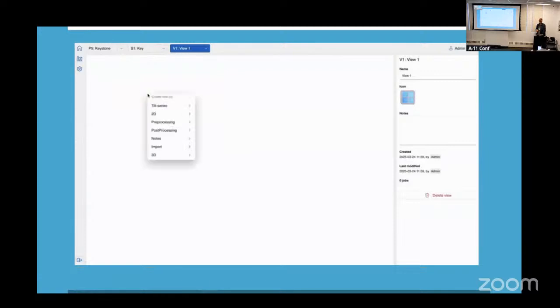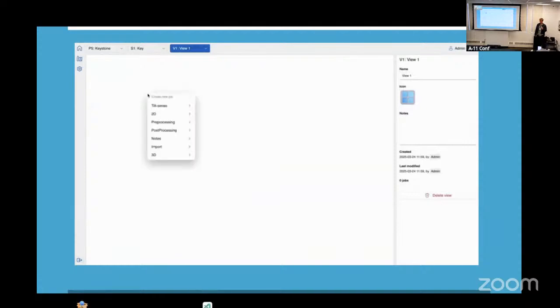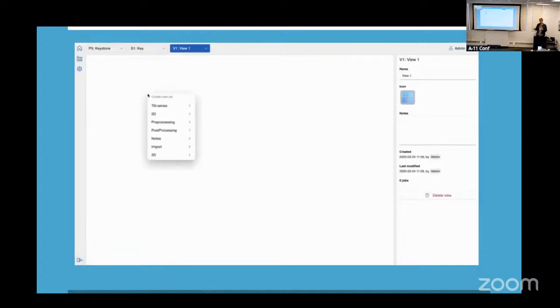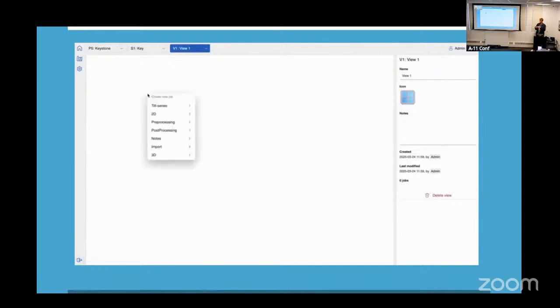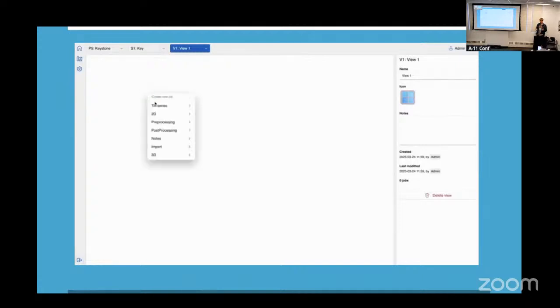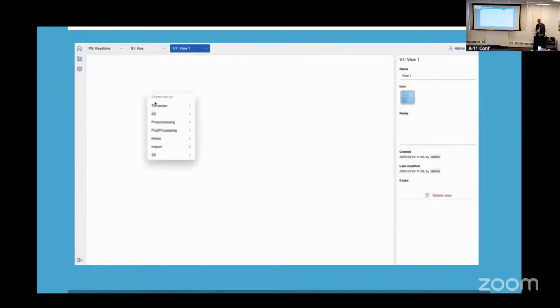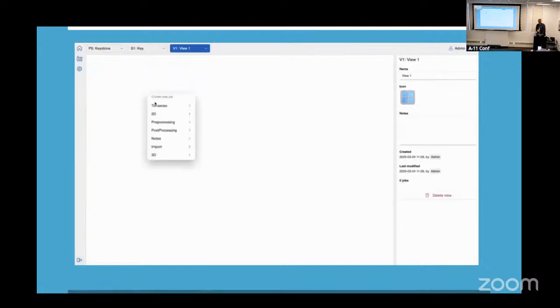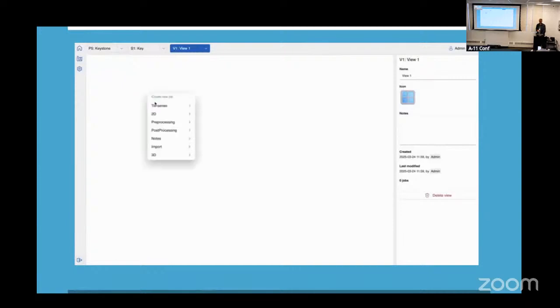And then within each space, you can have as many of these things called views as you want that we organize things into. I typically think of these as like you're processing one data set, or you're processing one object that incorporates multiple data sets, maybe. One block of processing that, say, might lead to one or a set of structures that all go together in a publication would probably end up in a view. That's the organization. And then once Dimitri is in this view, he imports a frame series data set, so sets up the parameters and things that he needs.